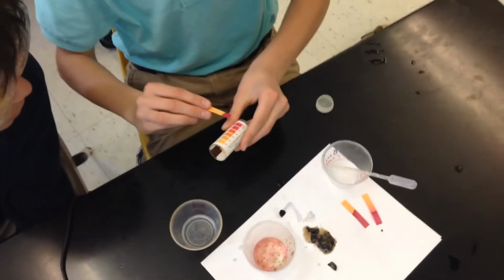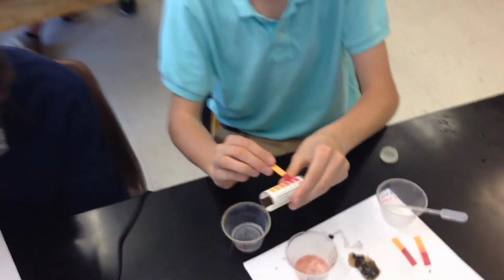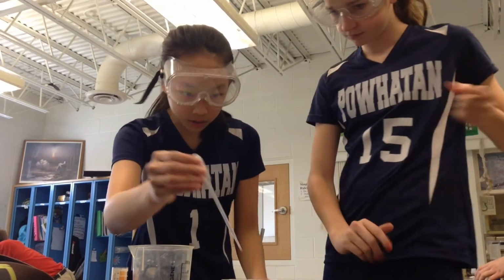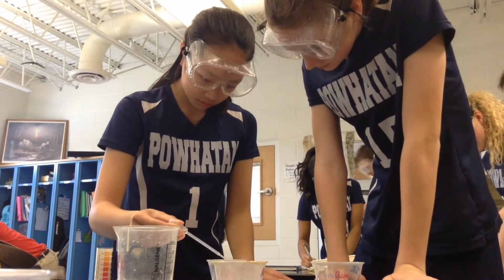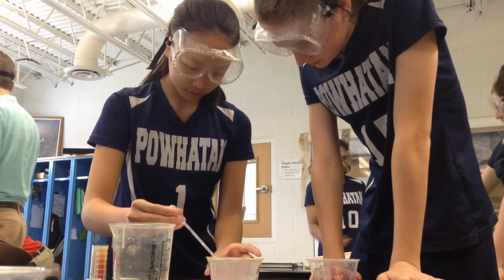If they added acid first, they go back and add base to increase the pH and see if they get another color change. Blueberries actually show 3 color changes, so the students were able to go back and forth adding acid and base to determine the number at which the color changed. And then the students just graph this on their pH scale to finish the activity.